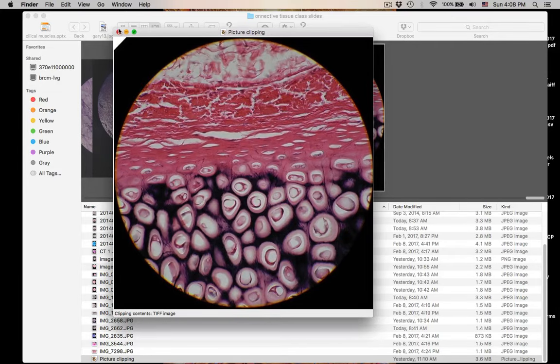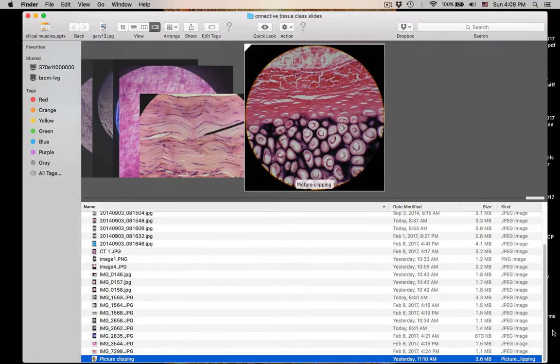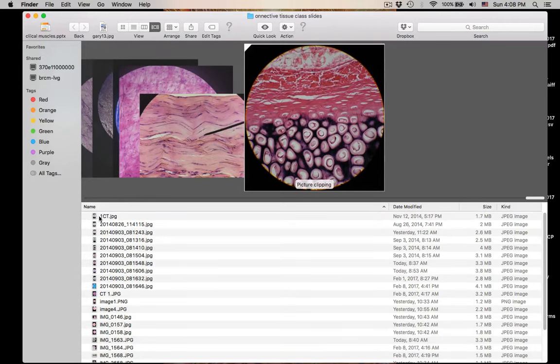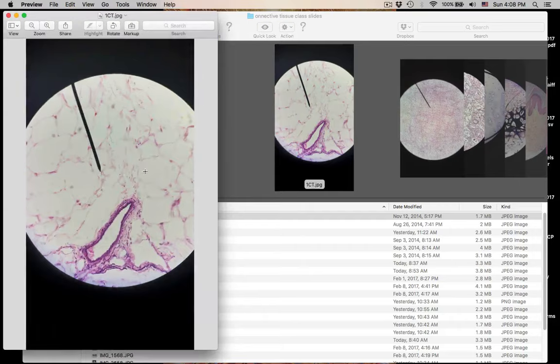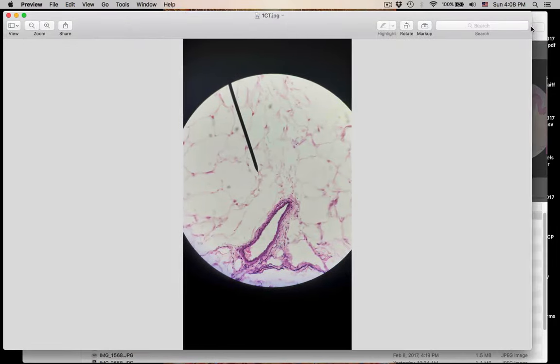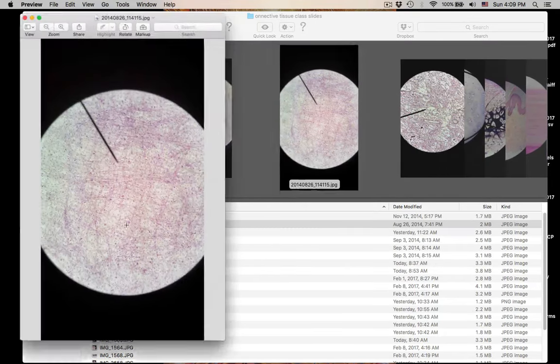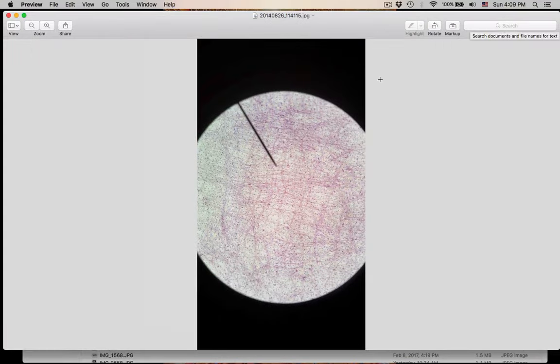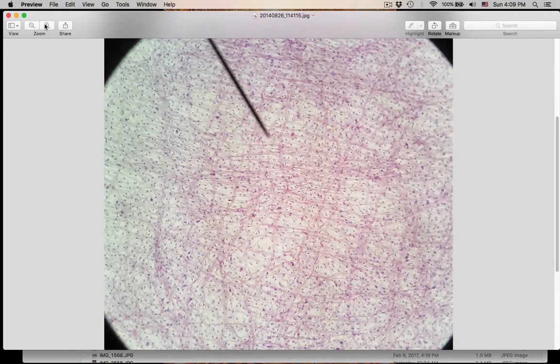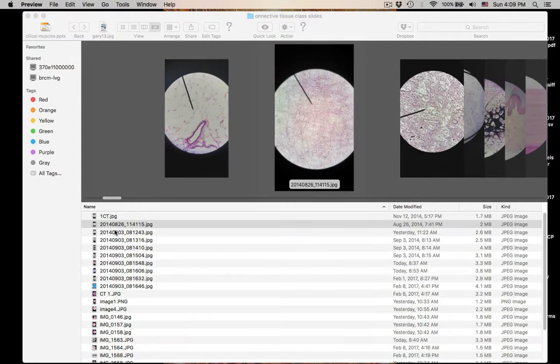So let's go back to the first one. Not a great picture, but number one is adipose — just fat, adipose. Number two: not very well stained, not really bright, but this is areolar connective tissue. It has that pick-up-sticks pattern — like you just dropped all the protein fibers and they're just laying all over the place. Areolar connective tissue.